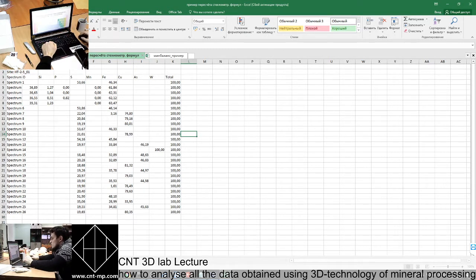Let me show you also. Okay, light elements like lithium, beryllium, boron, carbon, nitrogen, sometimes fluorine, helium, and etcetera. The main element we have to understand how much of it is in the sample is oxygen, and sometimes carbon, and sometimes hydrogen.